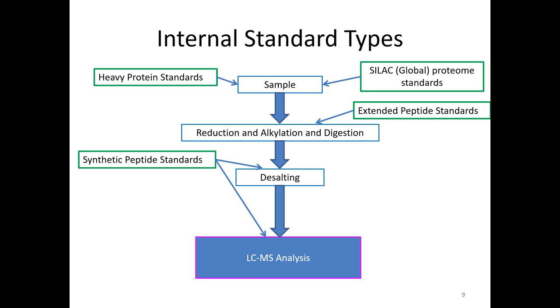There's also the issue of once they're expressed, how pure are they? What other things are in there? Does anyone know how we quantify pure proteins? How would you quantify a protein that you're going to use as a standard? You want to spike in a picomole into your sample. How do you know? You just read the concentration on the tube, right? But who told you that concentration?